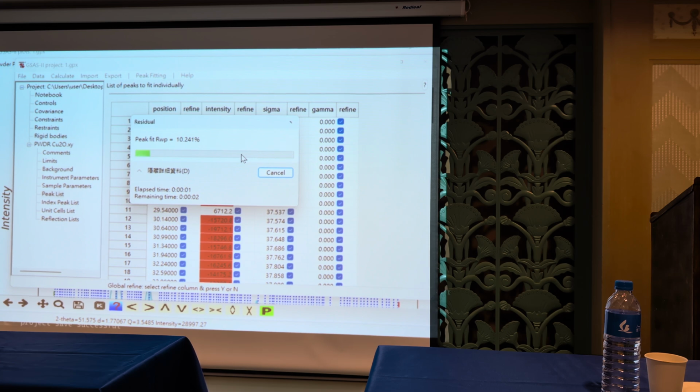There will be a structure that is very similar, and I will just insert the atom at the same place in the different compound. Or just make some replacement. So that will be much easier. But if you really want to index an unknown compound, that will take time.